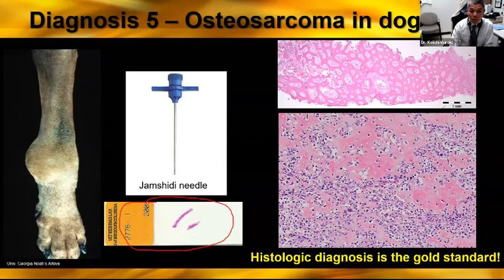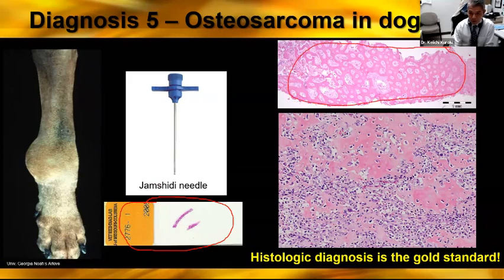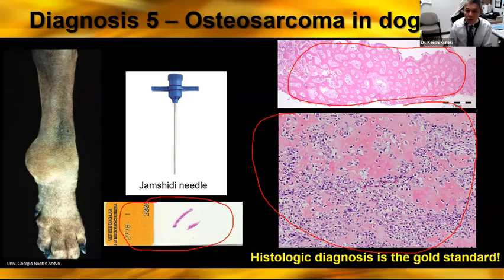This is one of the examples of a histology slide and good quality core bone core biopsies on a histology glass slide. This is a low magnification of the core biopsy specimen and this is high magnification of the lesion. You can recognize there are many spindyloid cells — those are neoplastic cells.